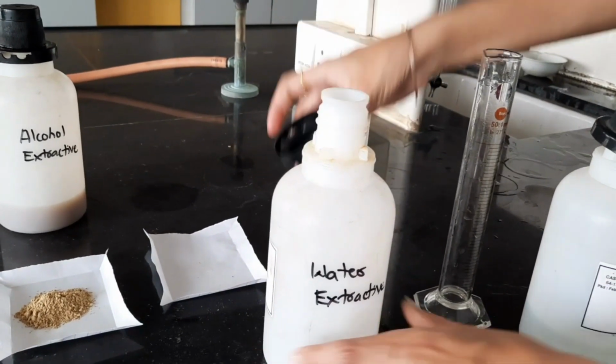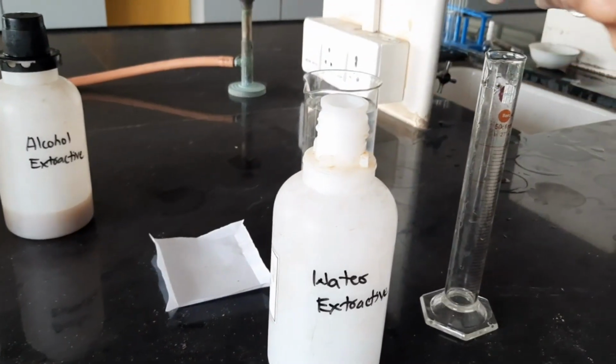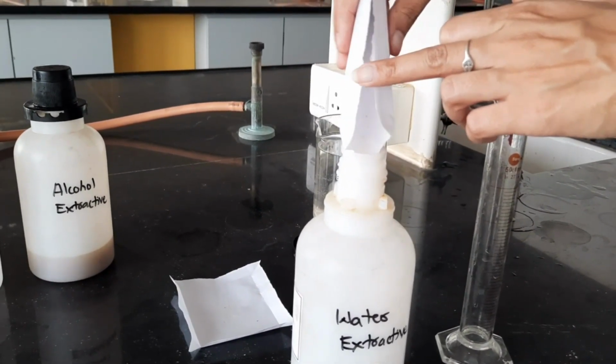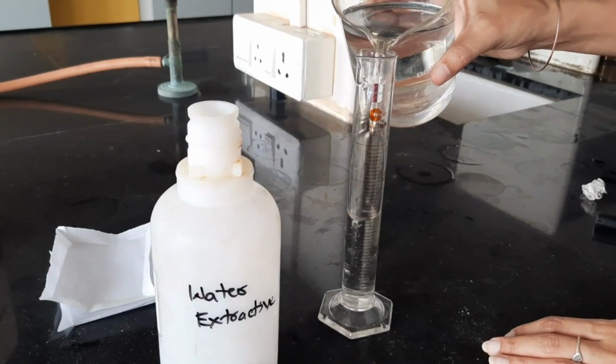Now we will perform the water extractive value. For that, we will add 3 gram of our sample into the bottle. To that, we will add 100 ml of water.